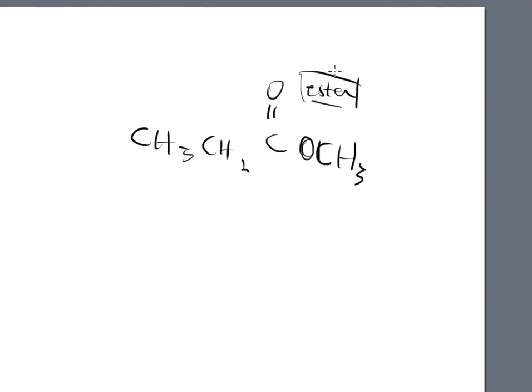All right, so let's compare where these electronegative atoms are and where the protons are in regard to that. So if I take a look at this example problem, the O's are the electron suckers, right? These are the most electronegative out of the molecule, and those oxygens have always been electronegative. This is nothing new to us. It's old news, move on, right? So if you look at these oxygens, what are they nearest to? Well, they're nearest to that CH2 group, and they're near this CH3 group. This CH3 group is the furthest away from all that mess, right?